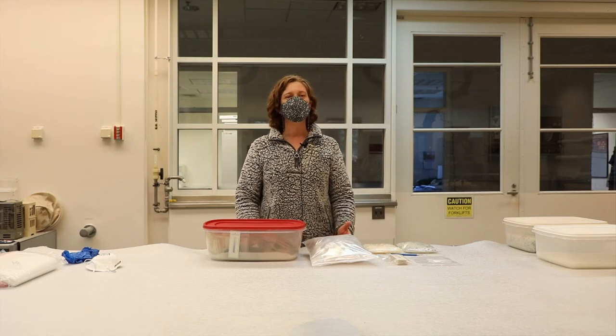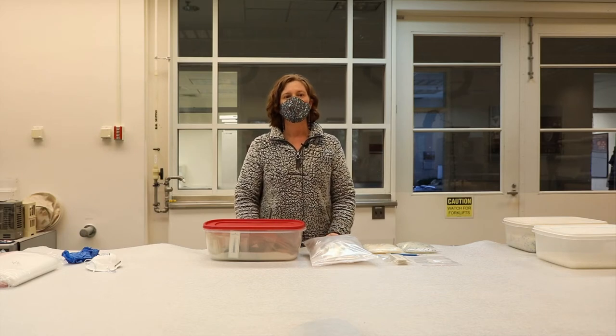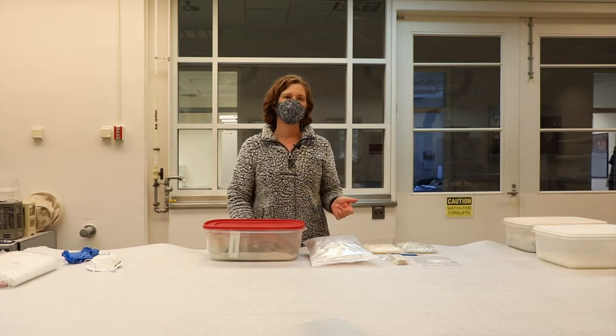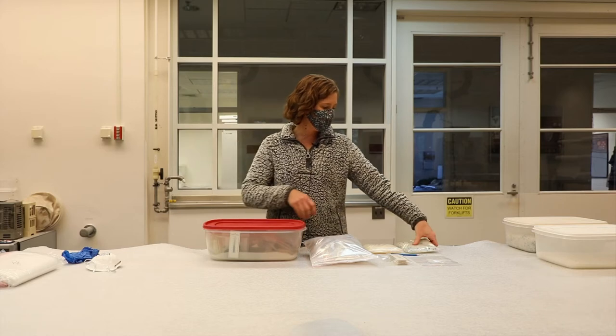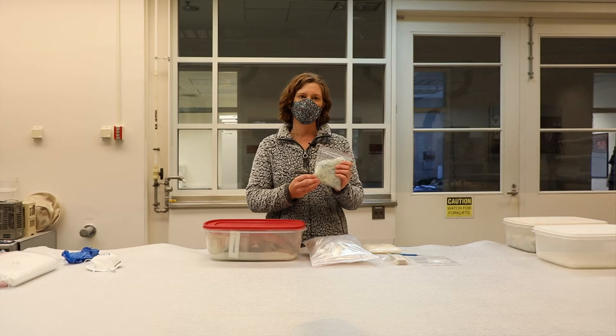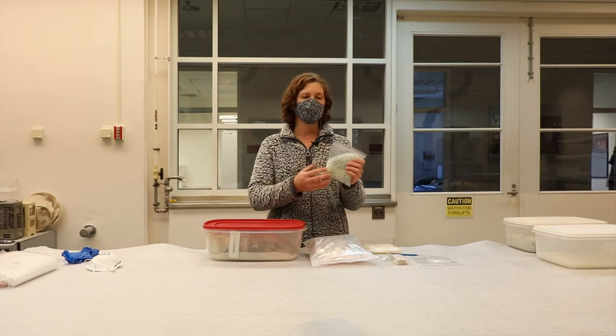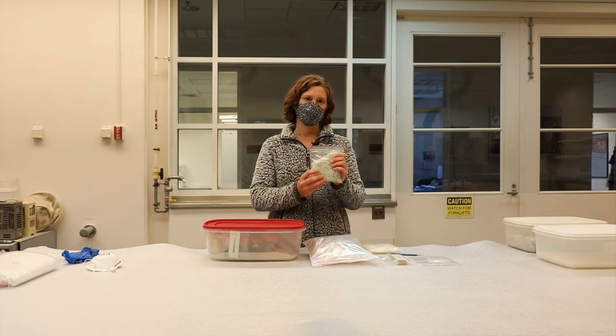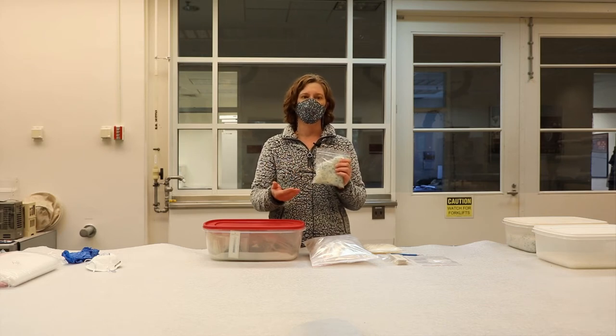After a period of time, the silica gel will absorb as much water as it can and will no longer function as a buffer. Indicating beads are an easy and effective means to determine when silica gel needs to be removed and reconditioned. A small portion of color indicating beads can be mixed in with the traditional silica gel beads. Because the indicating gel beads are more expensive, you only need to use a very small percentage — we're only using them as a visual key.